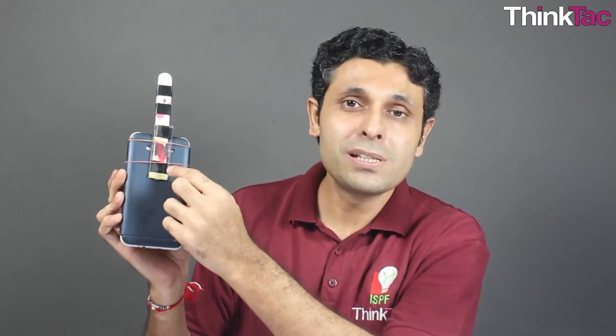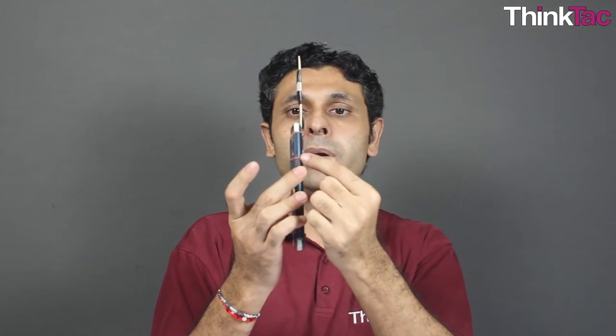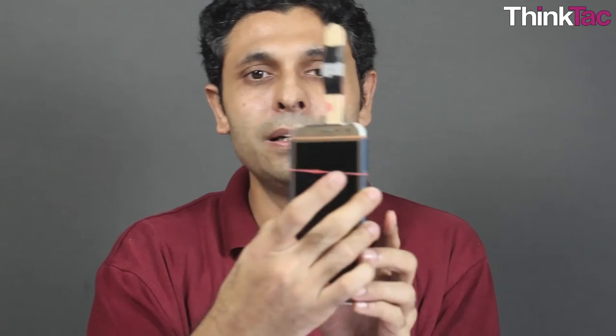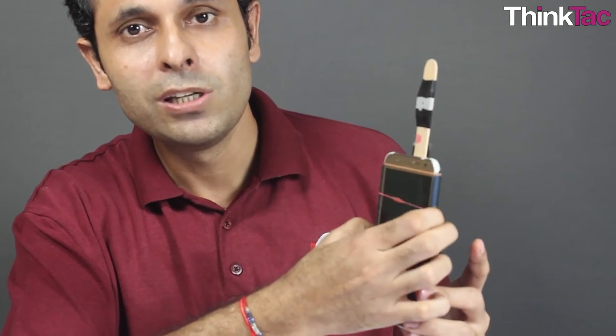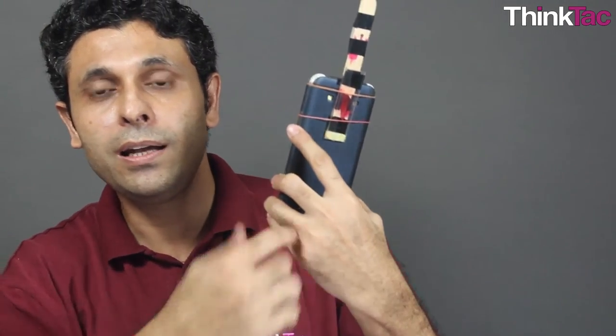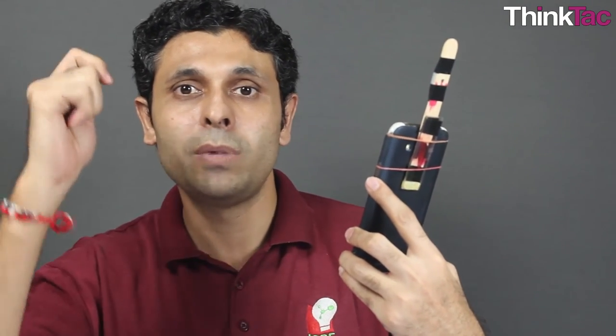If I want to give a view of this to everyone, there's another very interesting way. Because it is this simple in design, all I need to do is place the glass bead right behind the mobile camera, then the slide, switch on the camera, point the phone to a light source, and I can view what I would see with my own eyes. I can also click photographs and do some digital zooming. With the 2.5 millimeter diameter bead, you can even see the nucleus of a cell.